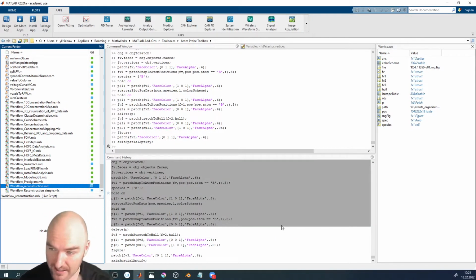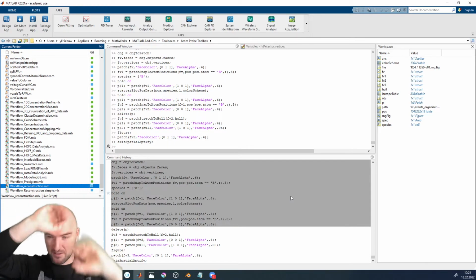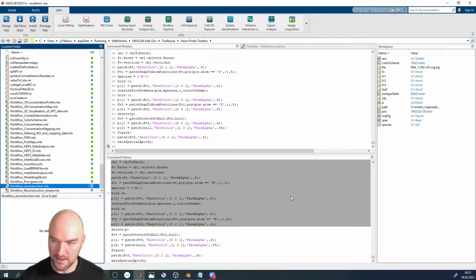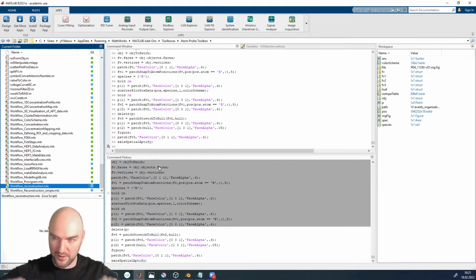With the only subtlety that we're in non-Euclidean space. So generally our interfaces are going to be curved somewhere in space. So I had to come up with a Lloyd's algorithm that works in non-Euclidean space, so in curved space, but I'm not going to go into detail about how that works. That would really go beyond the 10 minutes we still have left. The only thing you have to worry about is, well, you don't have to worry about anything because I've made it work in curved space as well. So it doesn't matter if your grain boundary is perfectly flat or not perfectly flat. You can still use that.